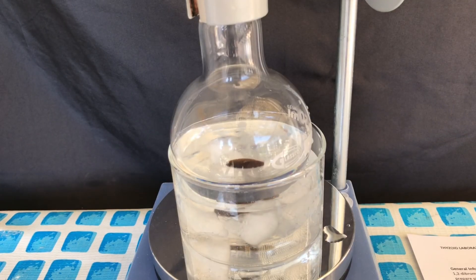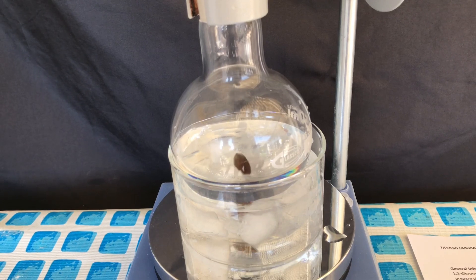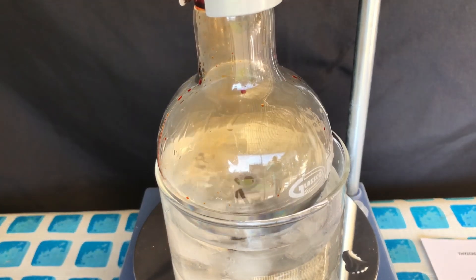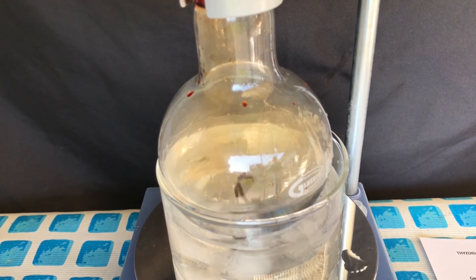The magnetic stirrer was turned on and afterwards we began with the addition of bromine. You can see that upon the addition, the color of the bromine immediately disappears again.